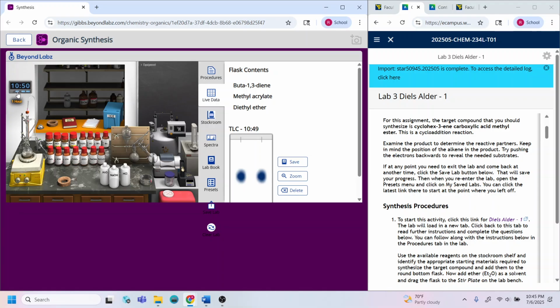This experiment is going to take an hour or so in order to get done. So we're going to go ahead and process this with an hour. First, let me start. Okay. So we're going to do 1 hour. So see, after 1 hour, I still have the remaining reactants, and I formed some of the product.